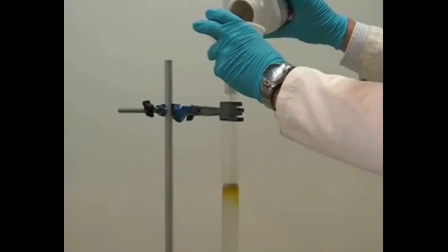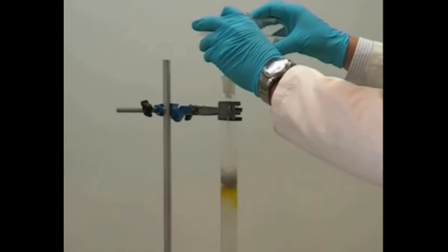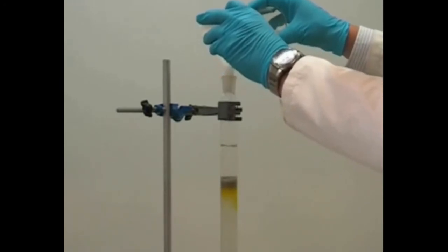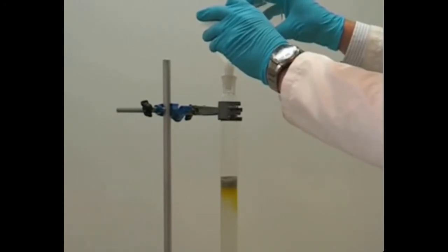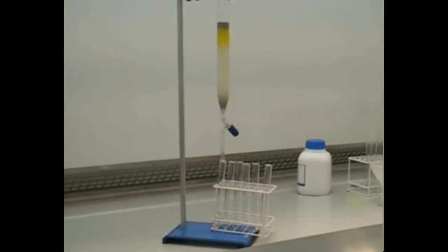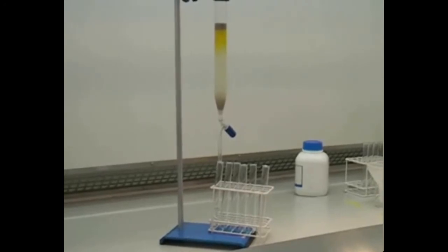Now we add some sand to a depth of about 1 centimetre on the top of the column. This will protect the silica as we add eluent. And here you can see us topping up the column with eluent. And we're now ready to run our column. So we open the tap at the bottom of the column, and this allows us to collect our first fraction.